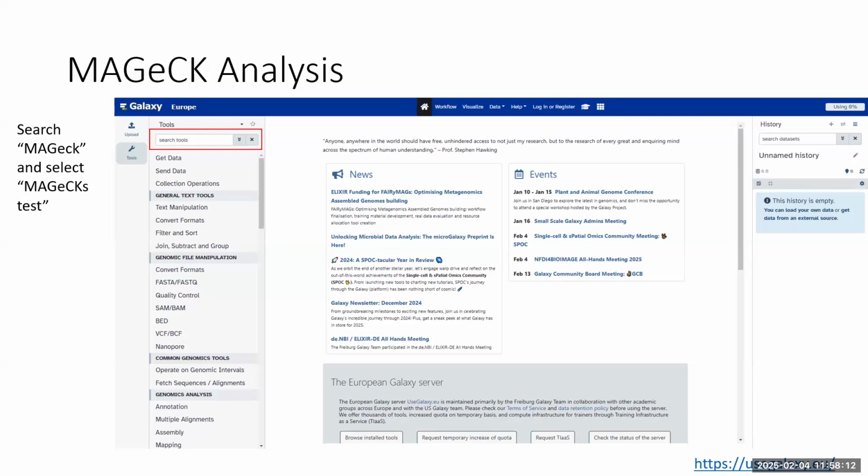It looks at the guide counts in each of the sequences, each of the samples, or the 3 to 4 guides for each gene. Then it gives you an overall fold increase or enrichment for that one gene, and the p-value, which is going to be based on, do we see the same pattern for all 4 guides, or maybe 3 out of 4 guides, or just 2 out of the 4 guides.